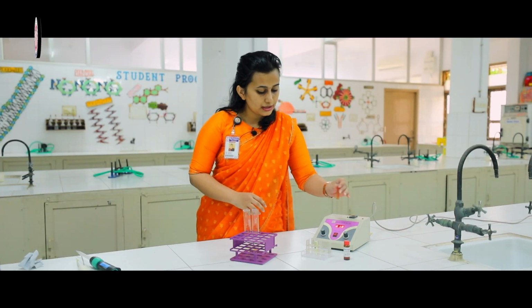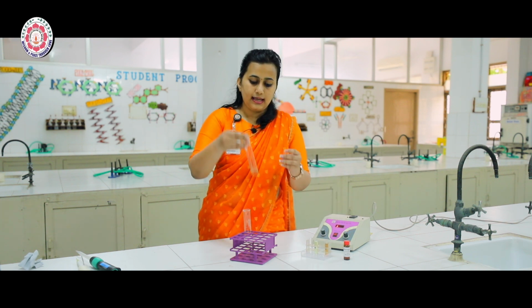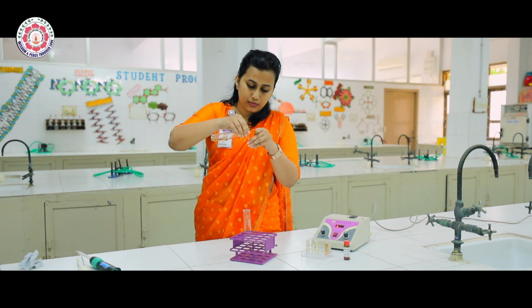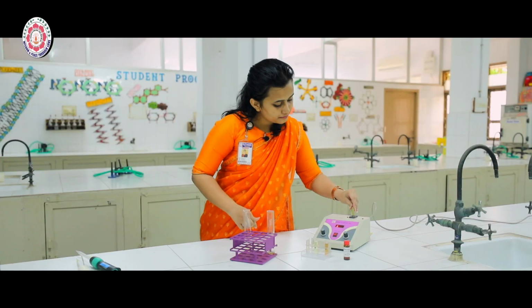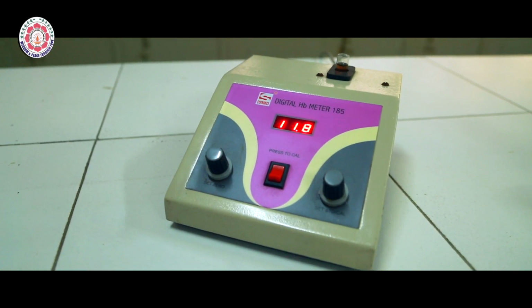Moving forward, now we can use the test sample. I will be using this cuvette, and this is the test sample with the blood. We take three-fourths of the cuvette filled with this sample and place it back into the slot. Whatever value appears on the screen, you can note it down, and this is how we calculate the amount of hemoglobin using Drabkin's method.